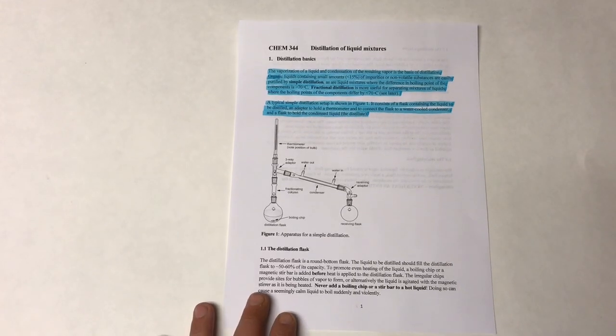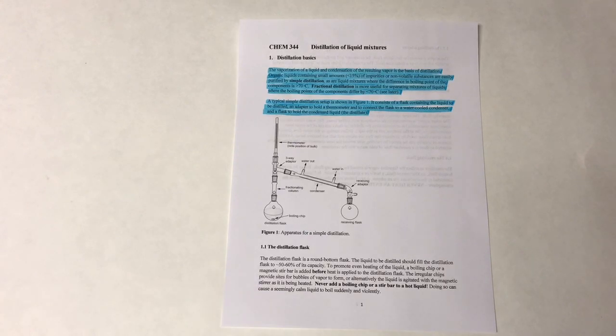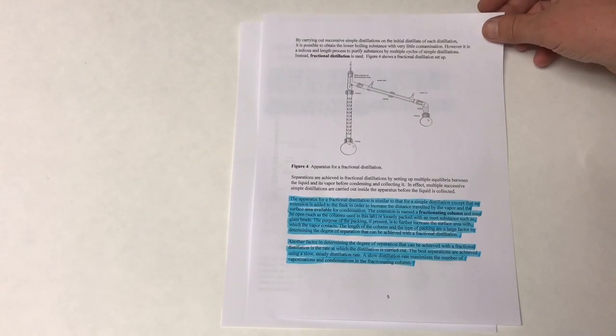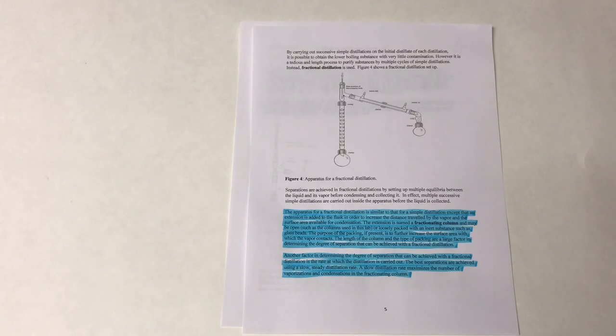So that goes over simple distillation and fractional distillation. Continue on with fractional distillation.